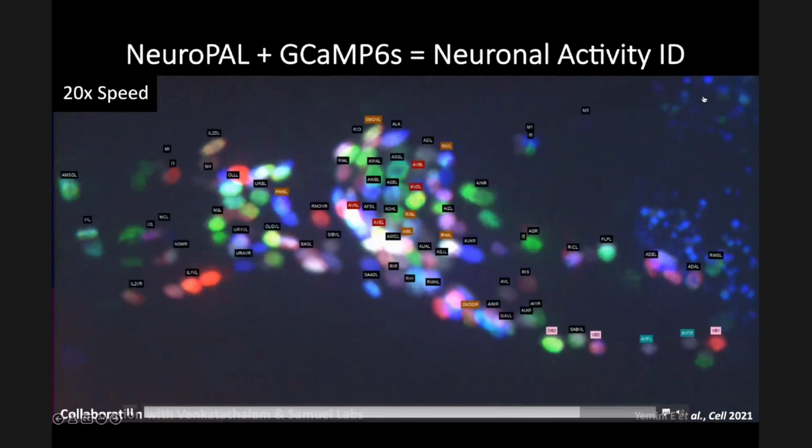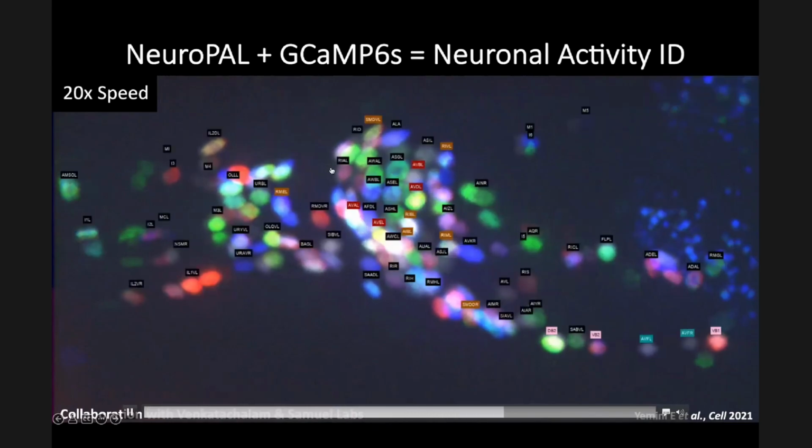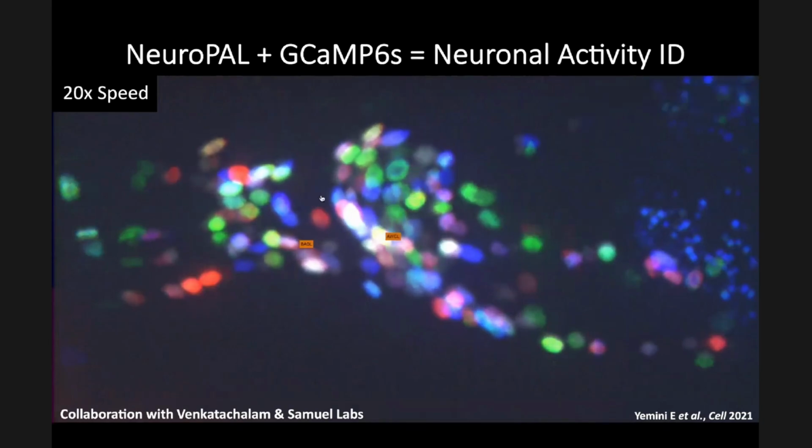In the top right corner here, you can see the stimuli that we're applying, and I'll get into those details. But anytime a stimulus comes in, you can see a variety of neurons basically responding to it. And I've labeled a large subset of those neurons, but not all of them because I didn't want to crowd out the image. But ultimately, you're seeing basically a worm responding to a variety of stimuli, and you're seeing what's taking place in its head.